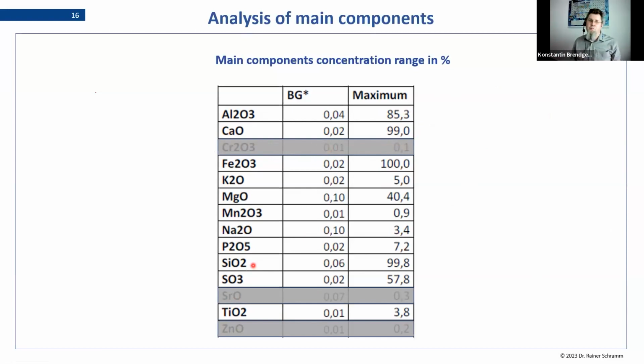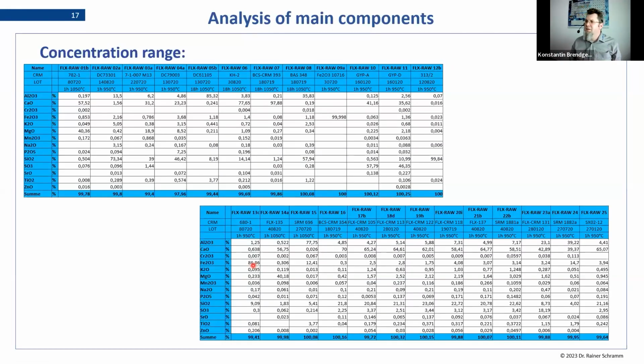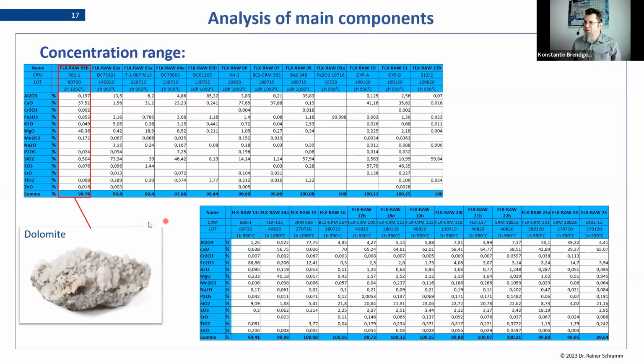And the measurement program that we are using is actually nothing special. It is our standard raw material program. The reason being is the standards, the certified reference materials that we use for that application, these are actually all mineralic samples. So as a few examples here, let me just go back. The first one is a dolomite.